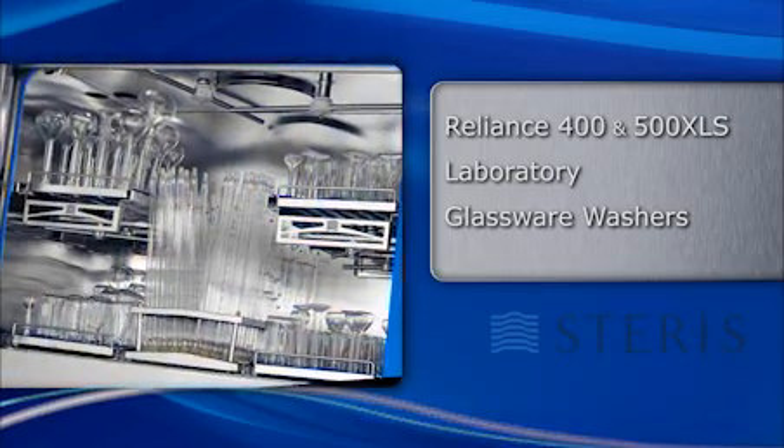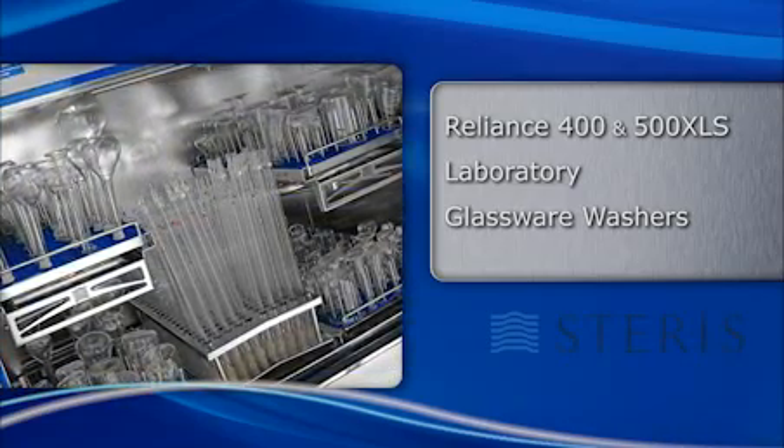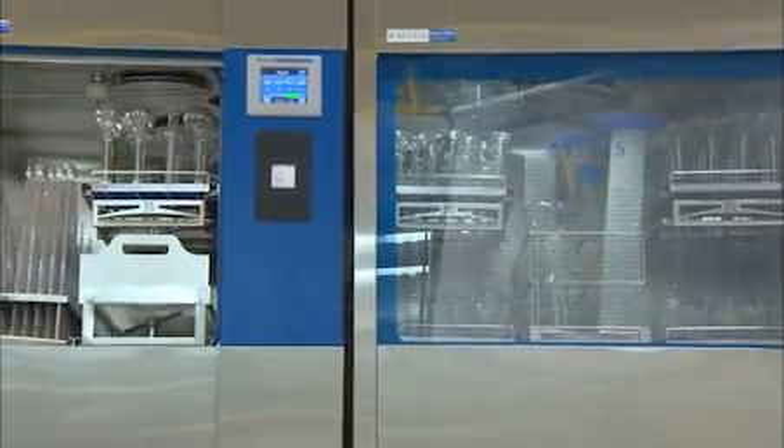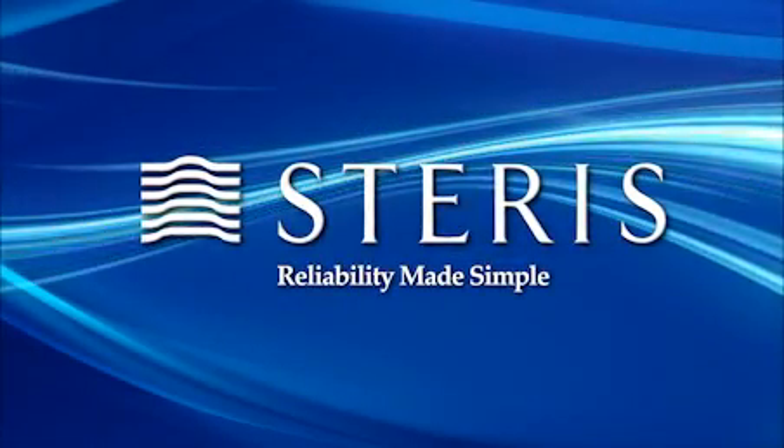When combined with Steris' unmatched global service capabilities and scientifically proven formulated chemistries, the XLS washers have no equal. Reliability Made Simple.